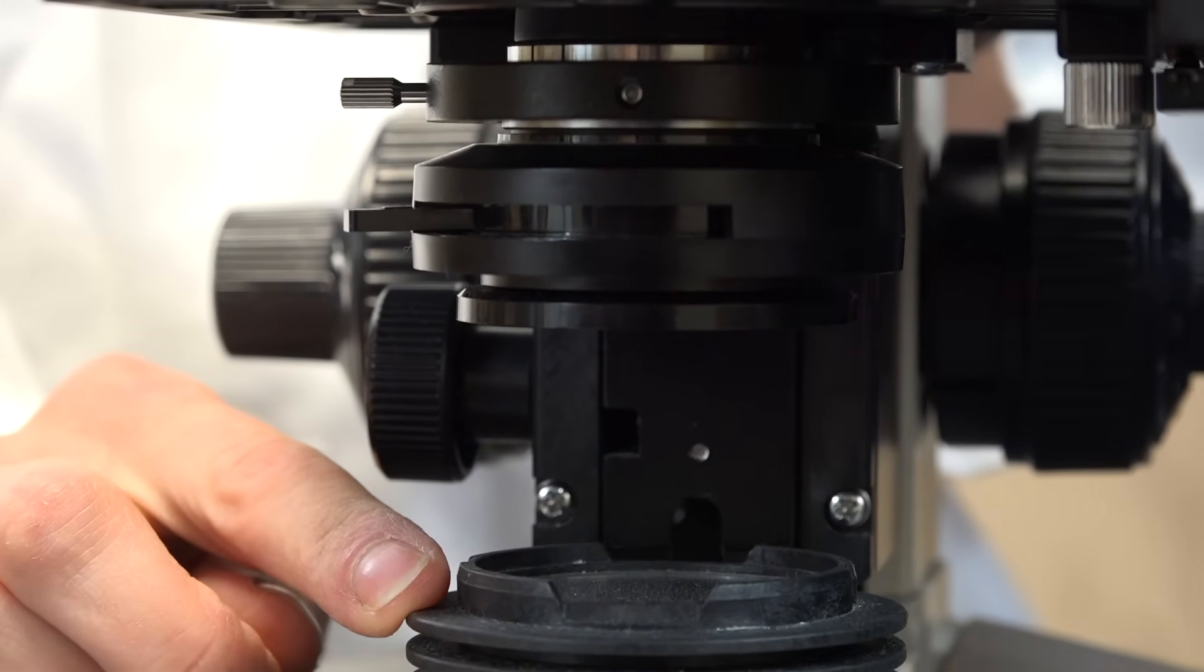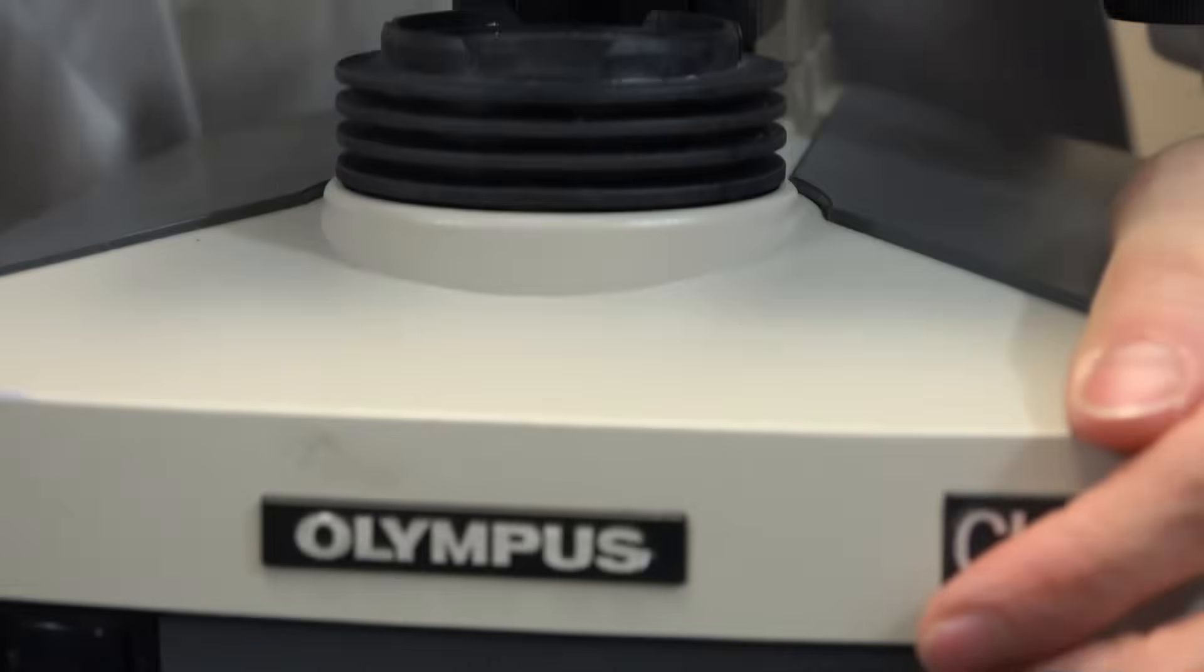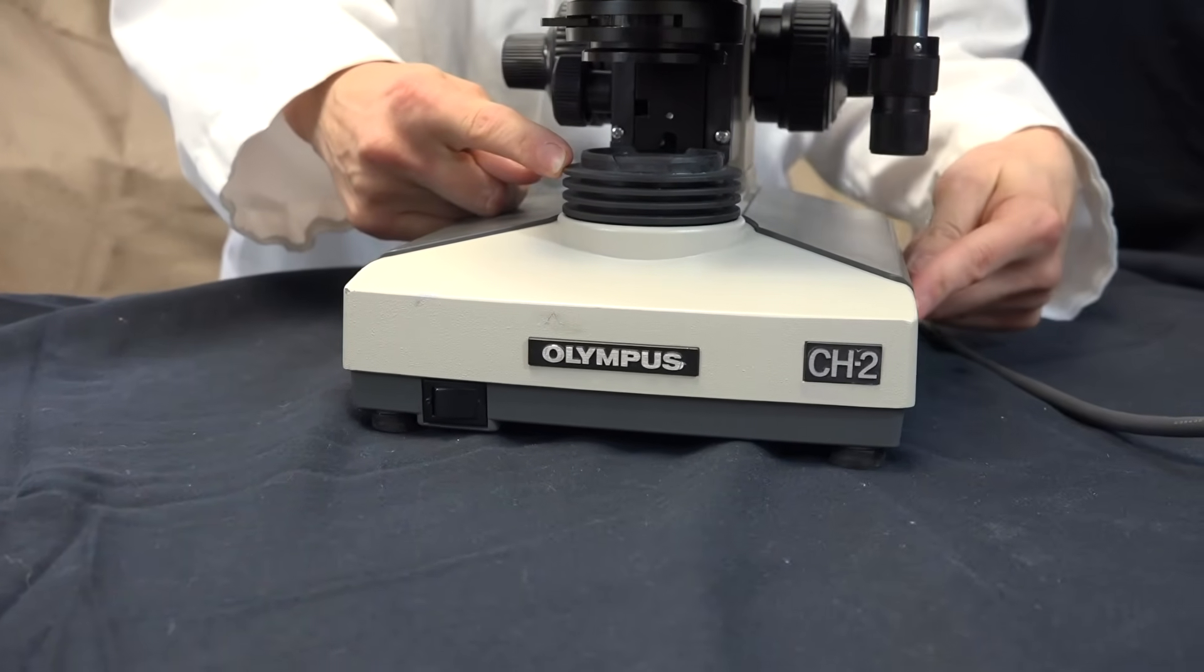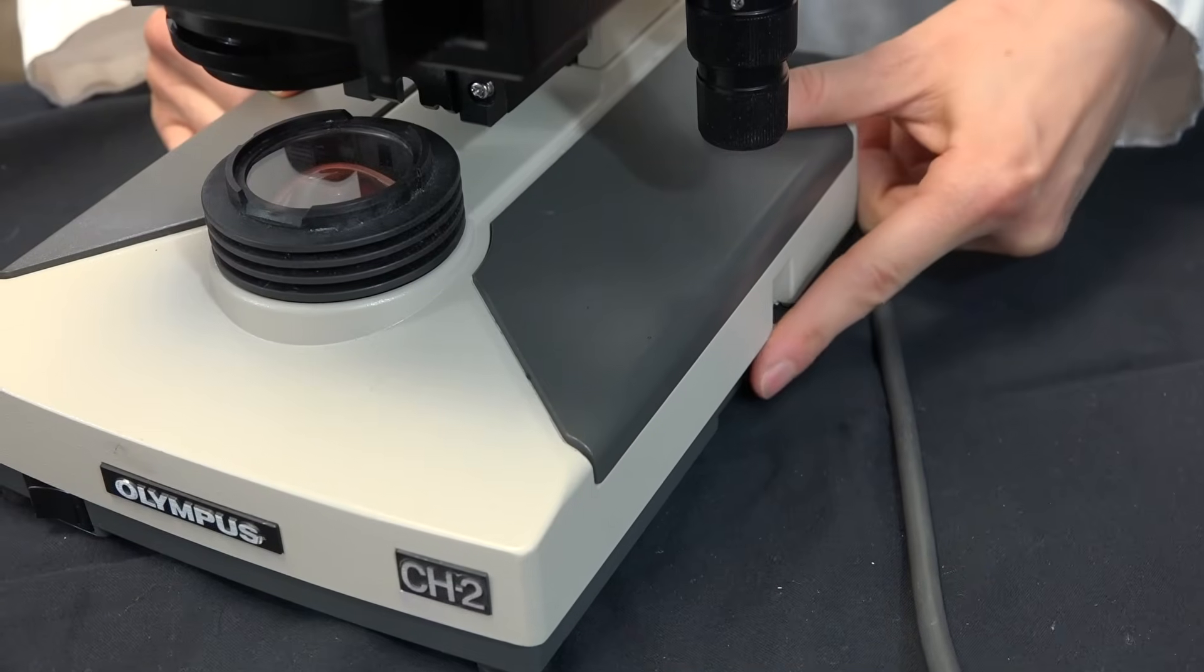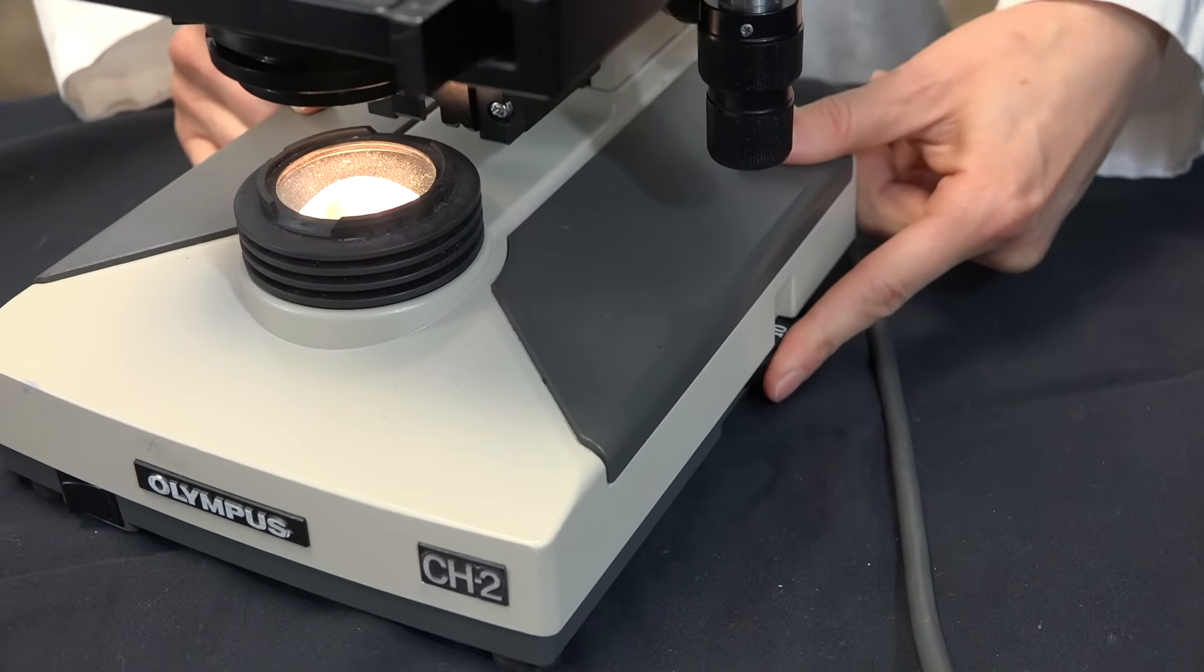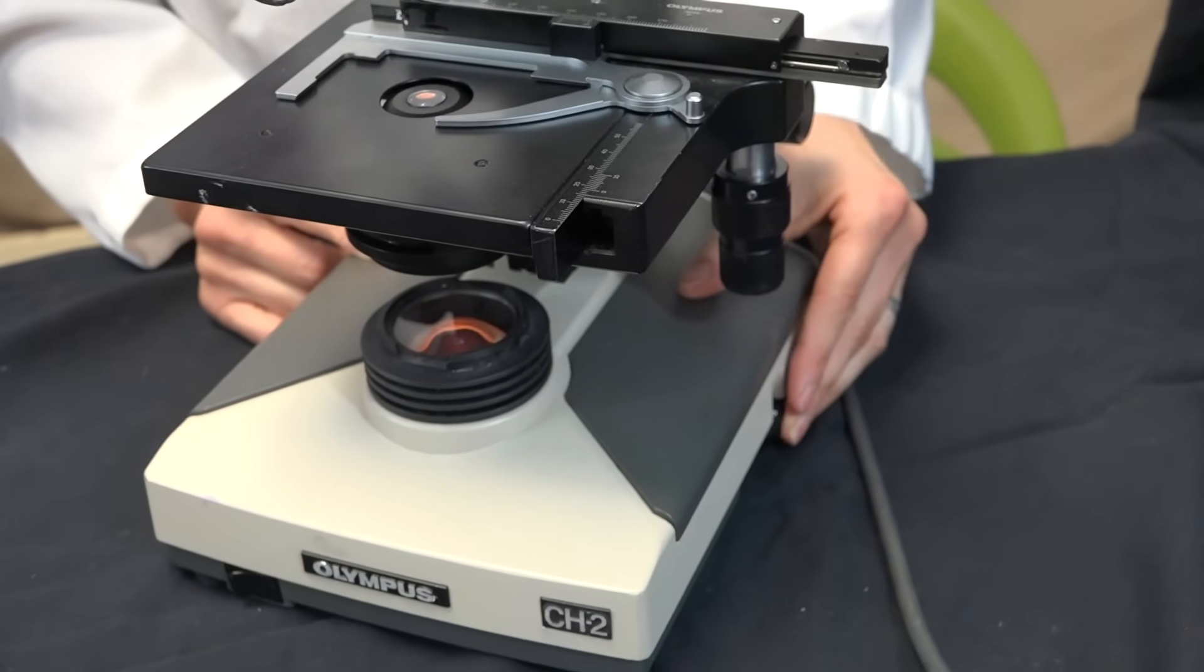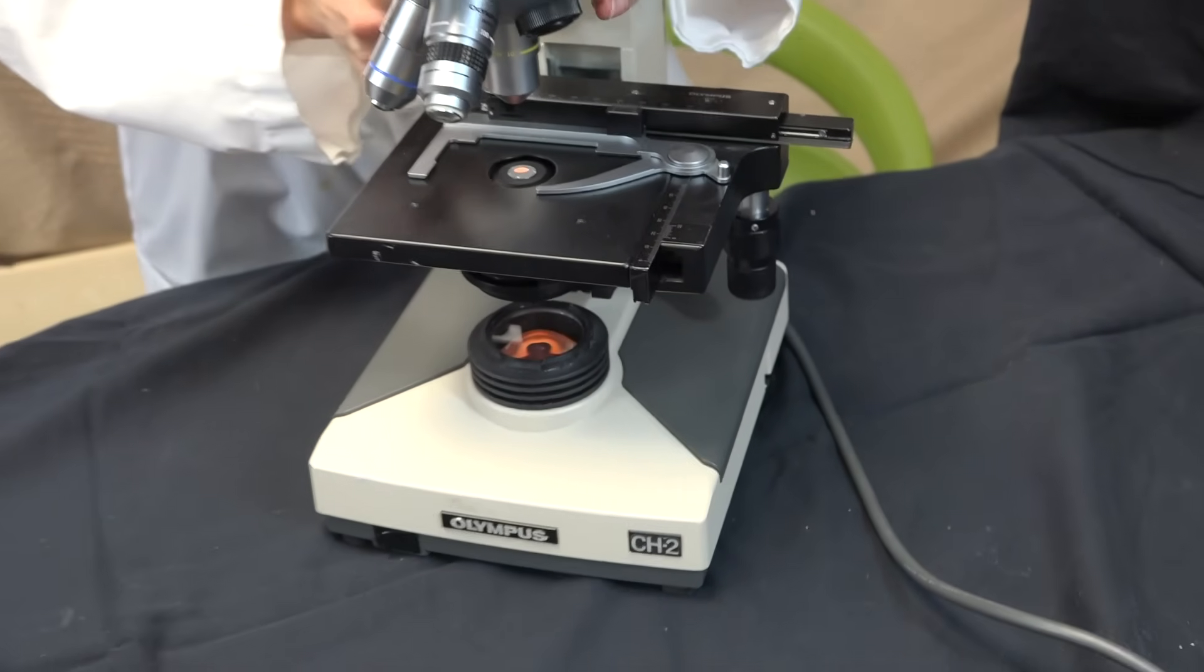Directly below the condenser is the light source. On the front of your microscope there is a switch which will turn on the light source and on the side of the microscope there is a dial. Turning this dial up increases the brightness of the light source. When you use your microscope it's best to start with the light relatively low and start with the lowest power objective in place.